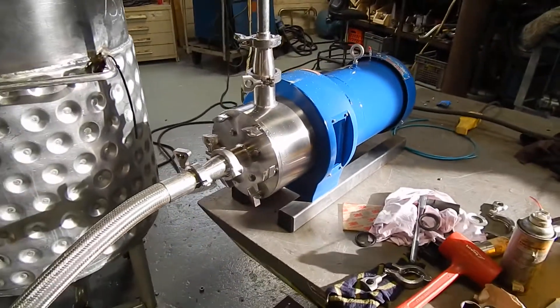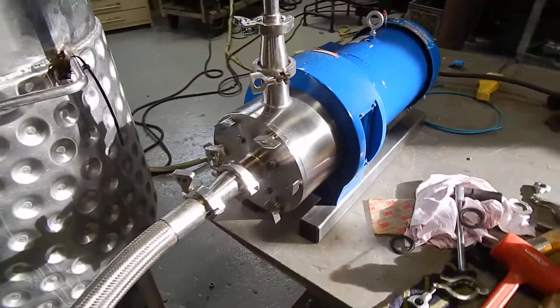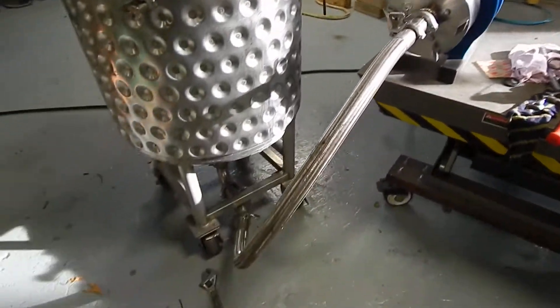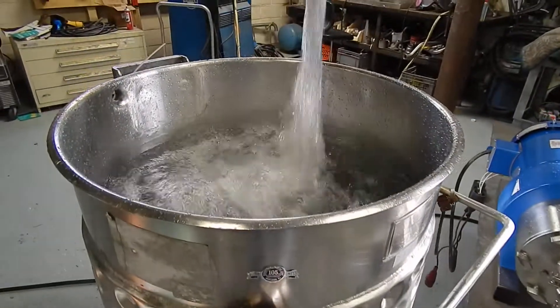It's a sanitary version. It's been completely rebuilt — everything's new inside — and it really has a good pumping action.